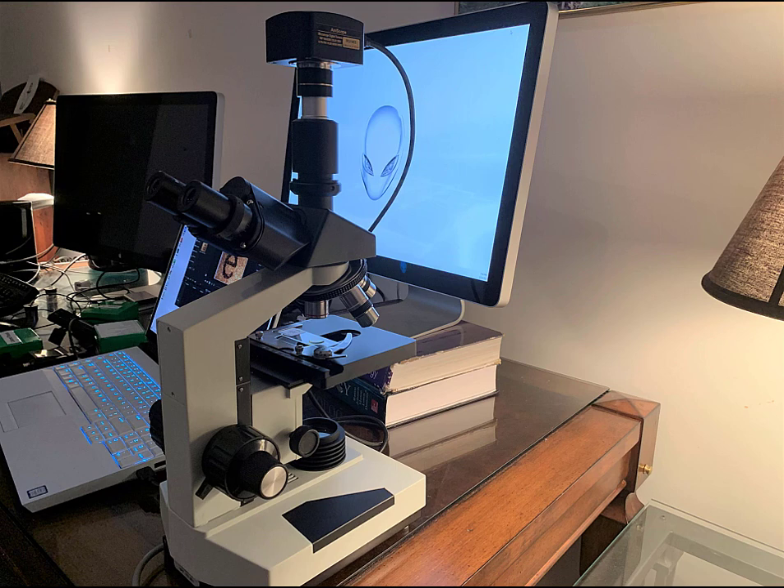Now that we've had a look at how to get out and set up a microscope, let's take a look at what it can do. For this demonstration, I'm going to use this particular microscope, which is very similar to the ones that we have in the lab, with the exception that it has a trinocular lens setup, which allows us to add a camera to the third lens so that we can capture the images that we're viewing on the slide.